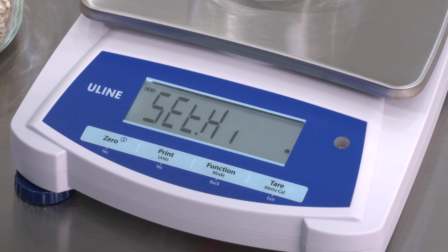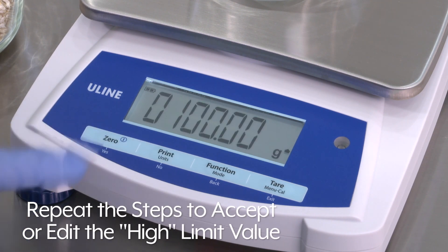Set High will be displayed. Repeat the steps to accept or edit the high limit value.